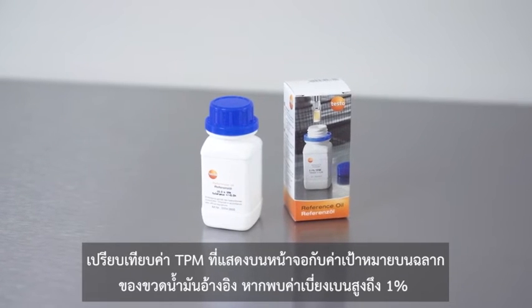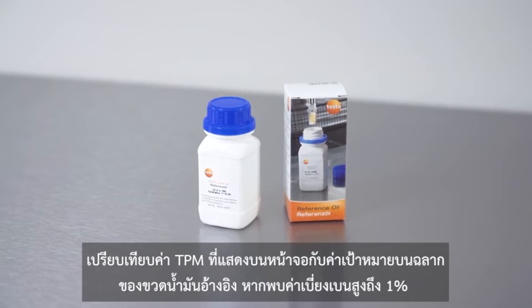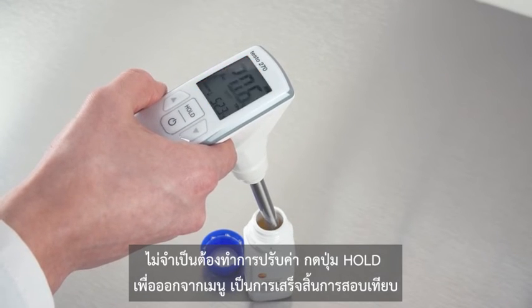Now compare the TPM value shown on the display with the target value on the label of the reference oil bottle. If a deviation of up to one percent is found, no adjustment is required. You can exit the menu again with hold and the calibration is completed.